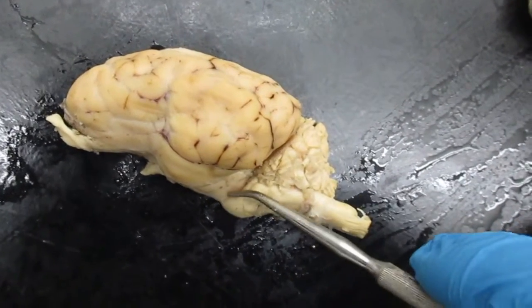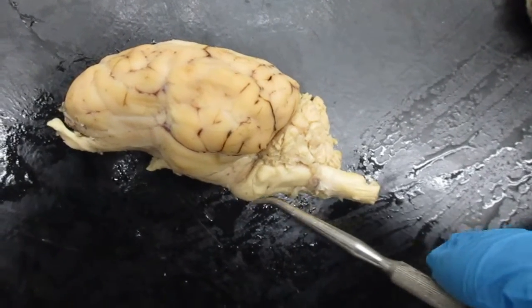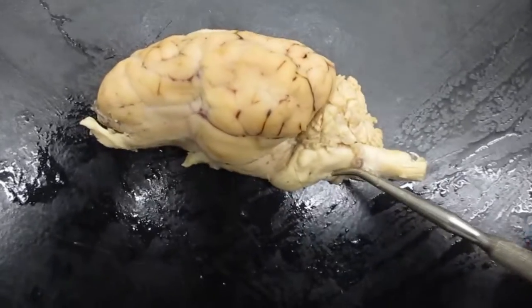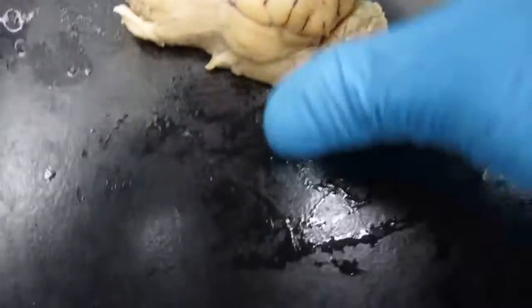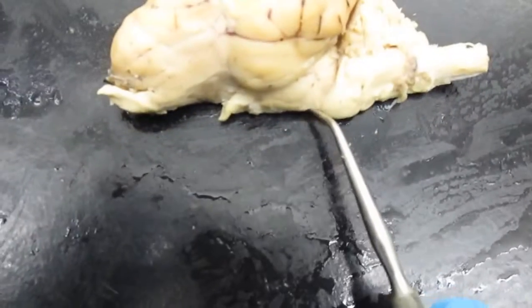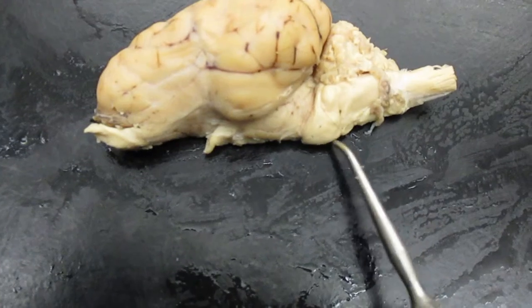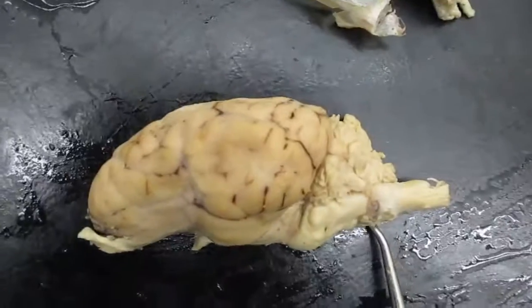Cerebellum. We have the first hump right here called the pons. Second hump is called the medulla oblongata. I think I said that wrong. Right here we have the pons and then medulla oblongata right here.